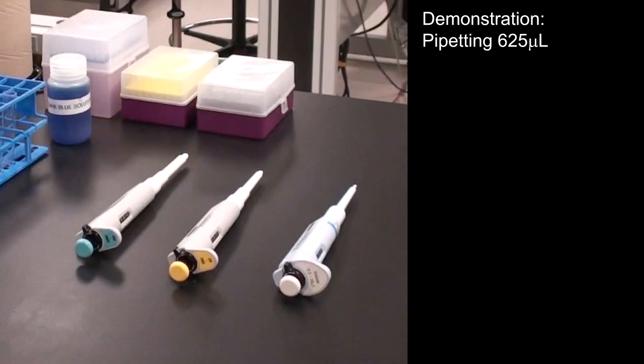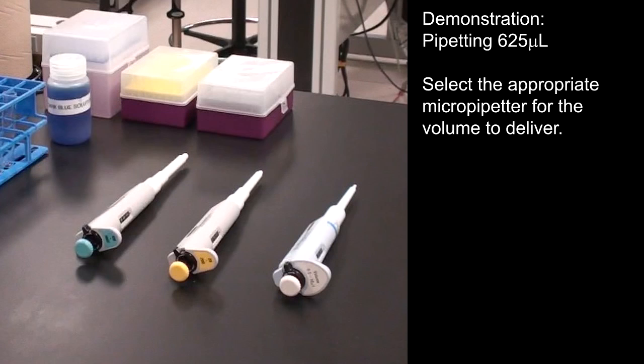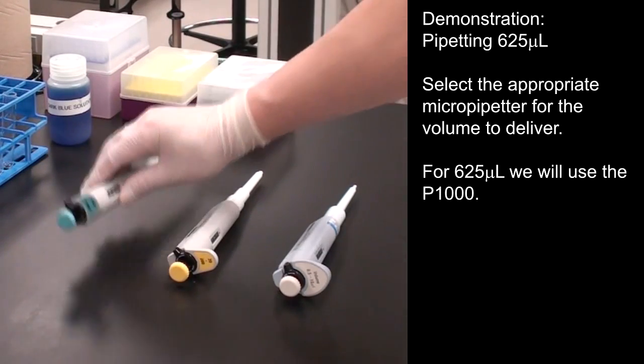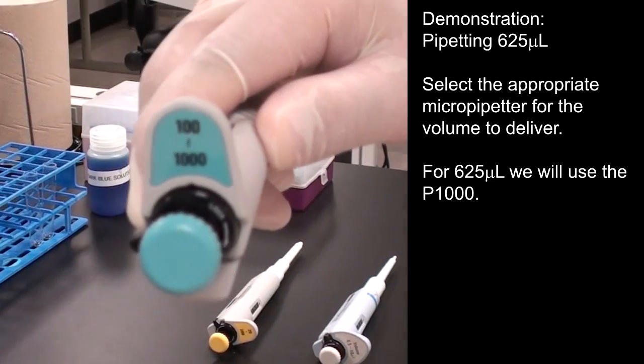We will demonstrate pipetting 625 microliters. Select the appropriate micropipettor for the volume to deliver. For 625 microliters, we will use the P1000.